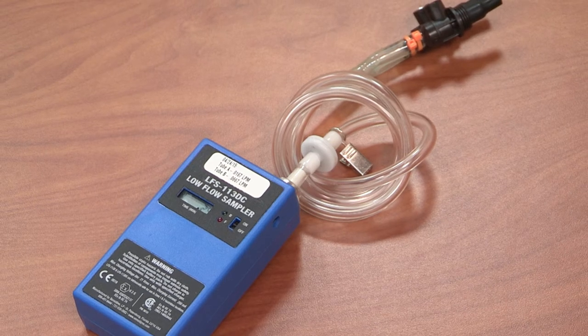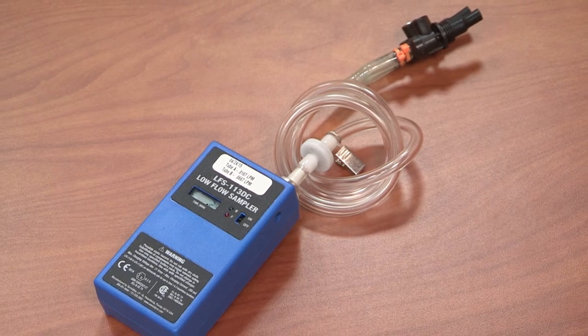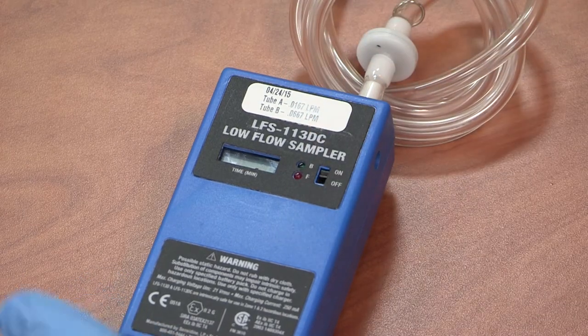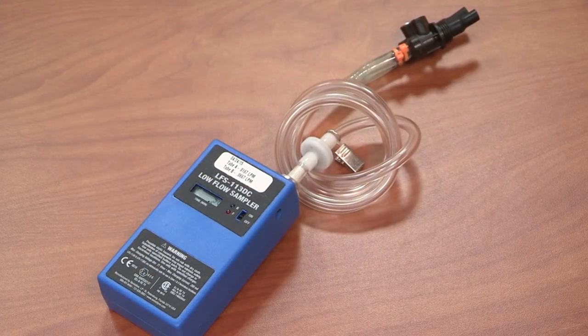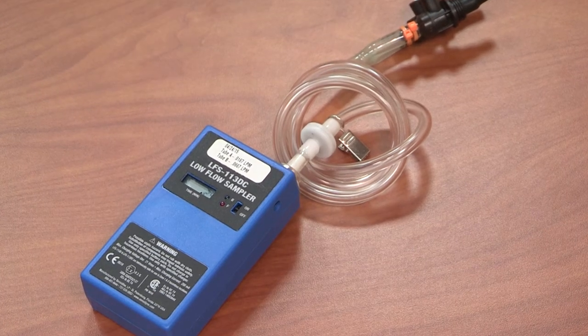Place the field blank tubes back in the bag they arrived in and seal the bag. Remove the sampling pumps from the case. Before use or calibration, be sure to allow the pumps to run for upwards of two minutes to ensure proper calibration is reached. You will need to use the provided screwdriver to turn on the pump.